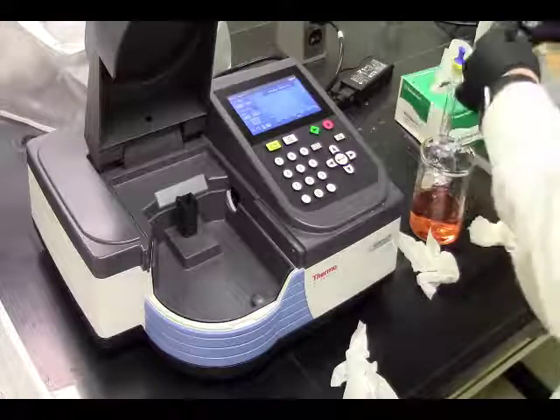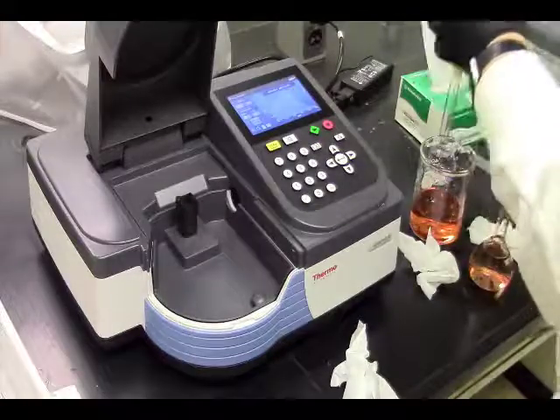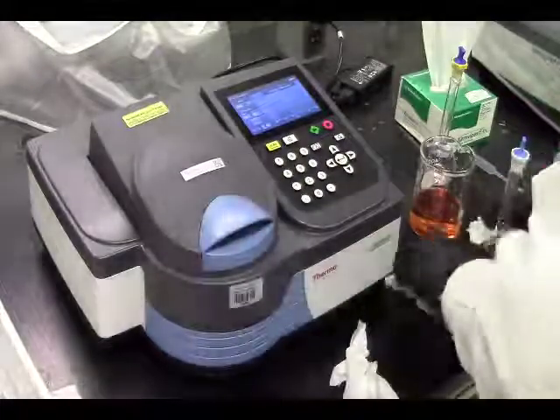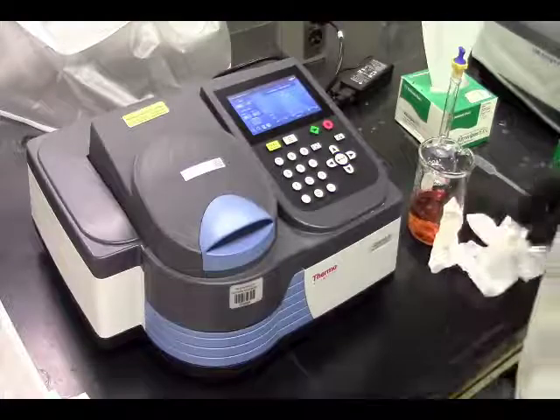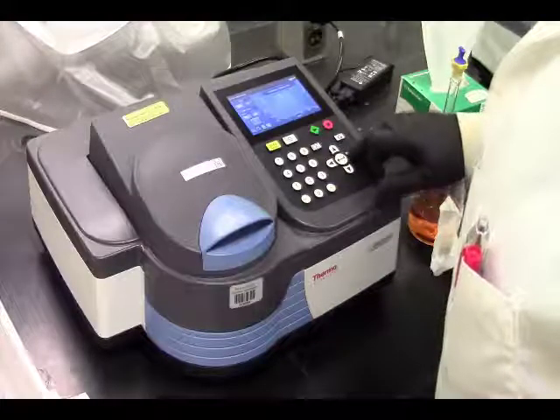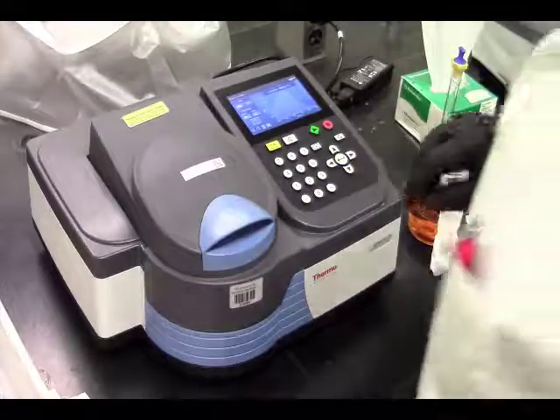Three rinses. Fill. Wipe this off. Pop it in. And let's read that. Then we'll go back and do our first point for our standard curve, since it has definitely been 10 minutes now. This is 0.145.